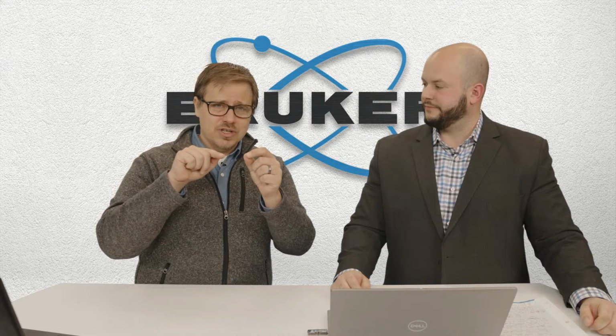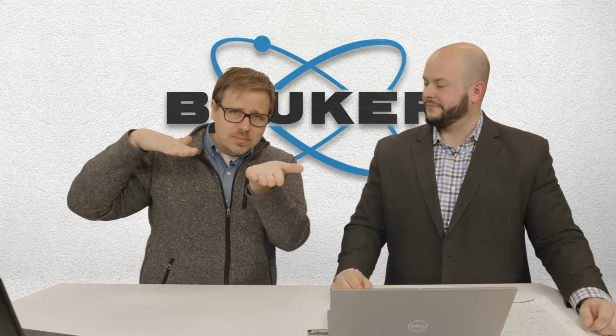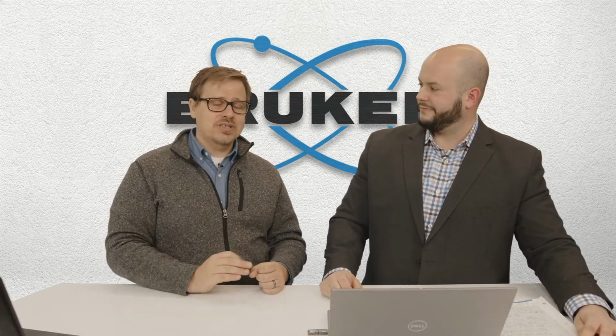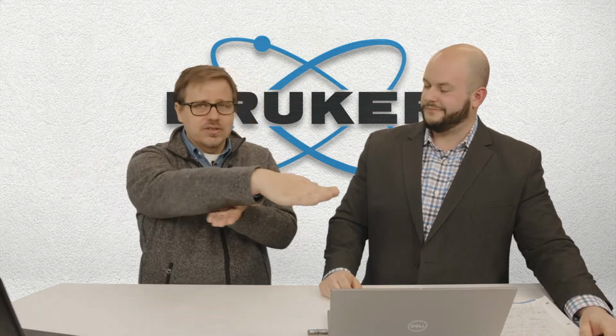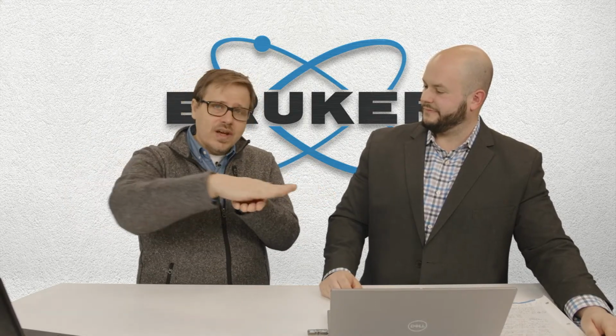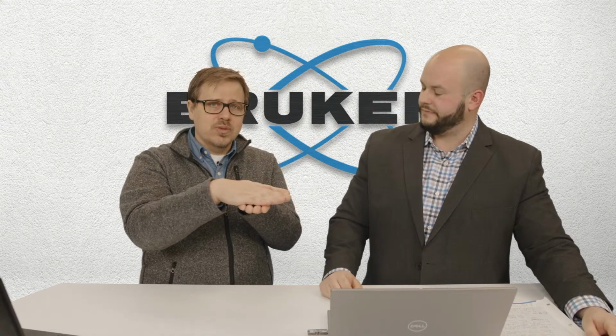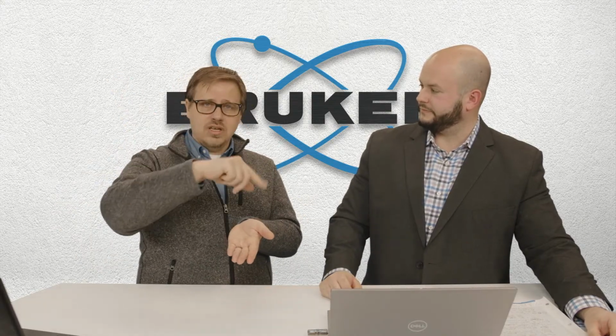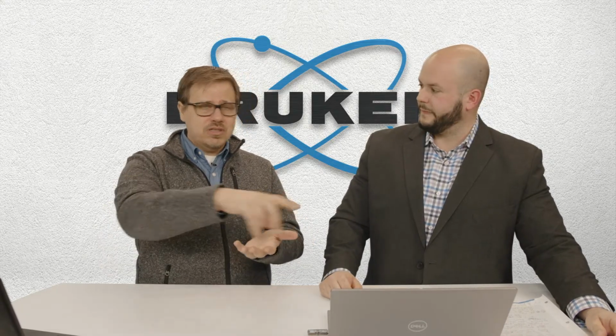Now what GISAXS adds to it is, we're not just doing the classic transmission SAXS measurement, rather we're going to take the beam and bounce it off of the sample surface. So yes, in that case, we are going to be coming in at a very low angle. In fact, the ideal angle for GISAXS is right at that critical edge, because that's when the beam comes in and is redirected along the surface of the sample, catching a bunch of information. You can do this in a one-dimensional method, so you can just park at that critical edge and then do a scan of your detector, and you're going to get something that looks like these XRR curves, but it's coming from the particulate that's on the surface.